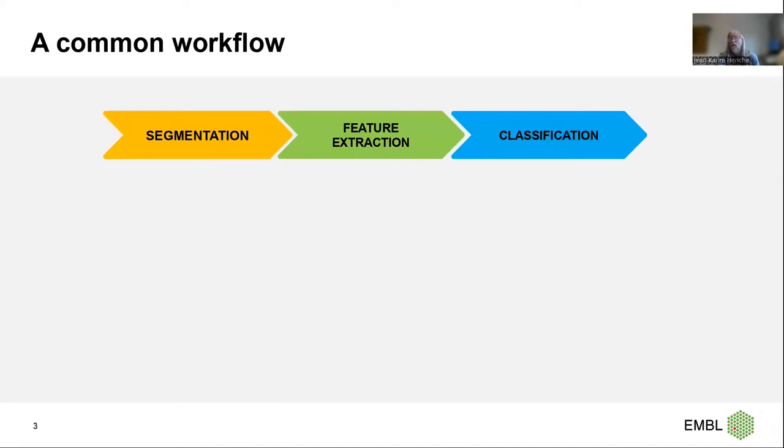From a data analysis perspective, what these projects have in common is a workflow which starts with segmentation to identify objects of interest, typically cells or nuclei, followed by feature extraction and use of the features to classify the objects.